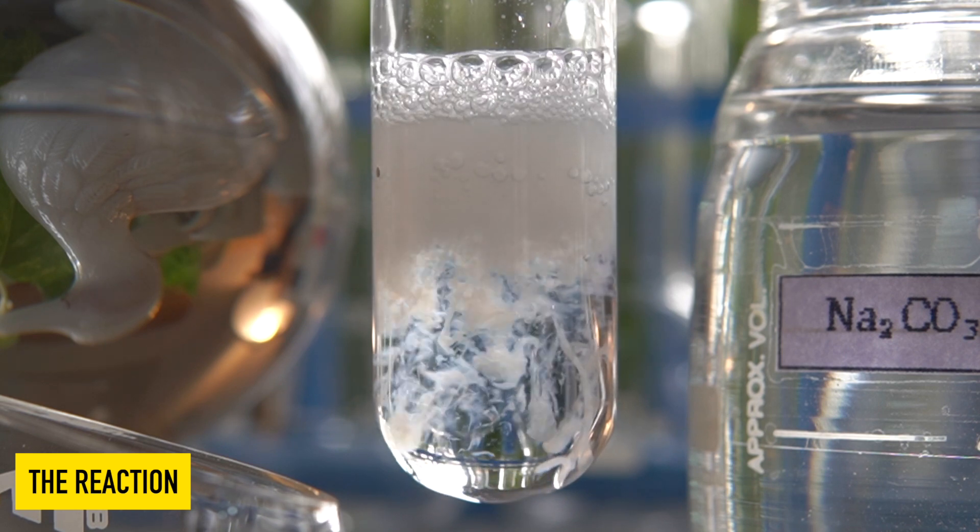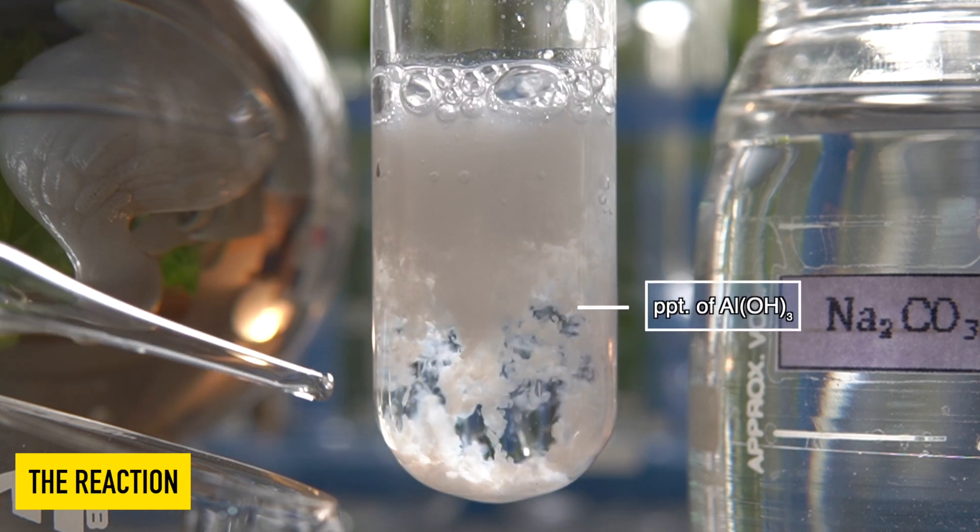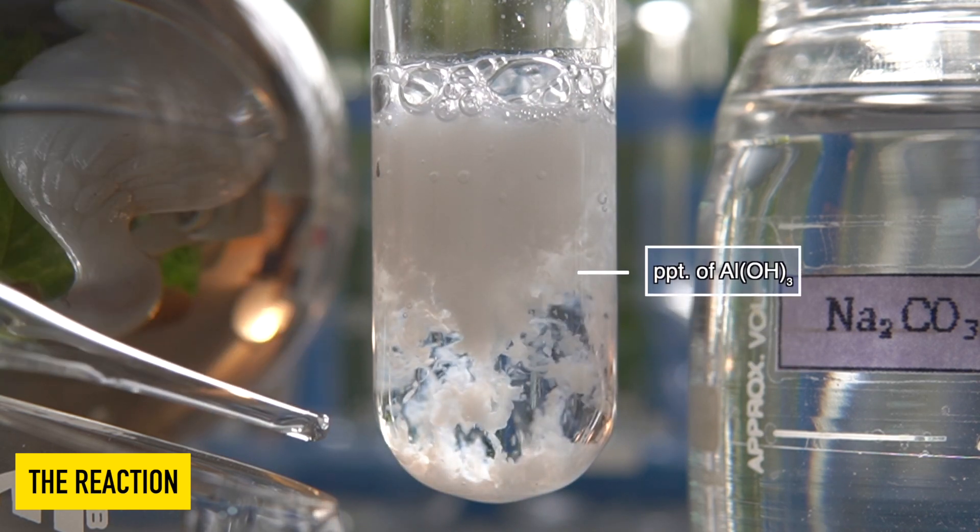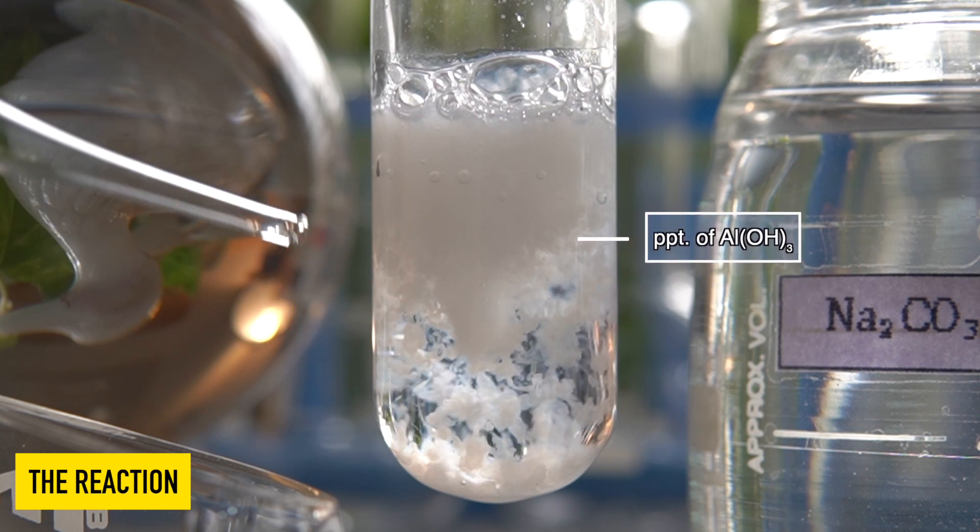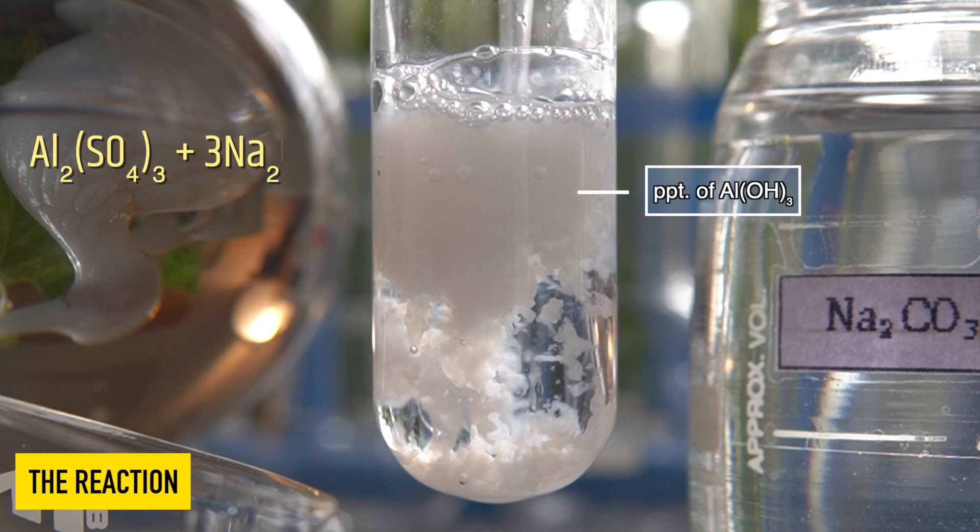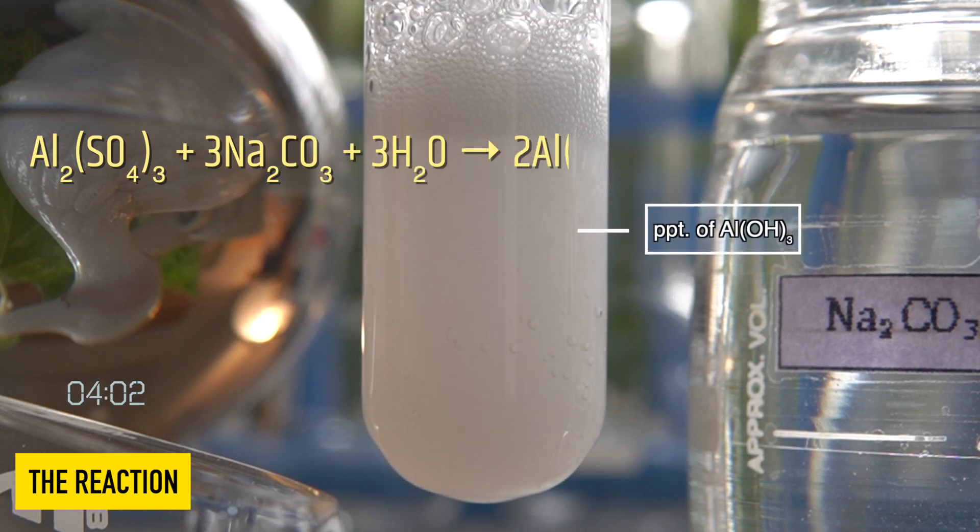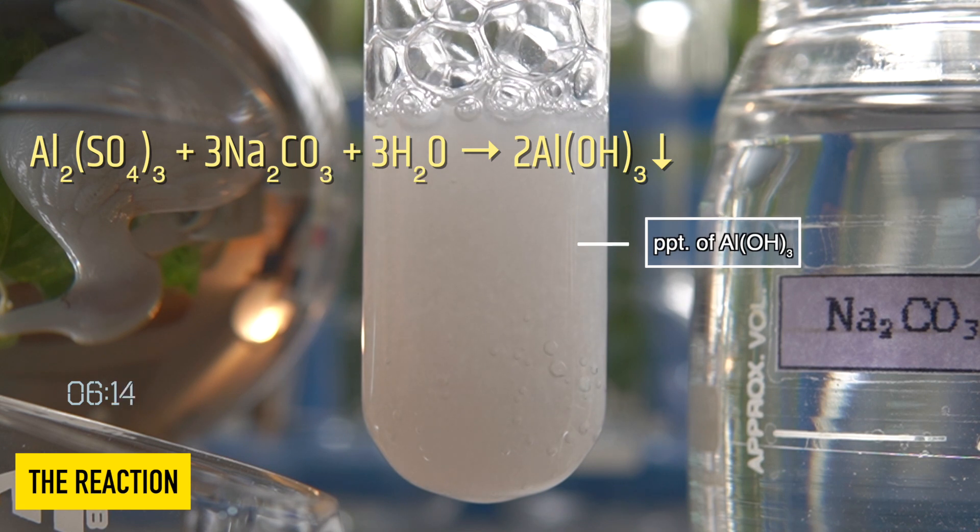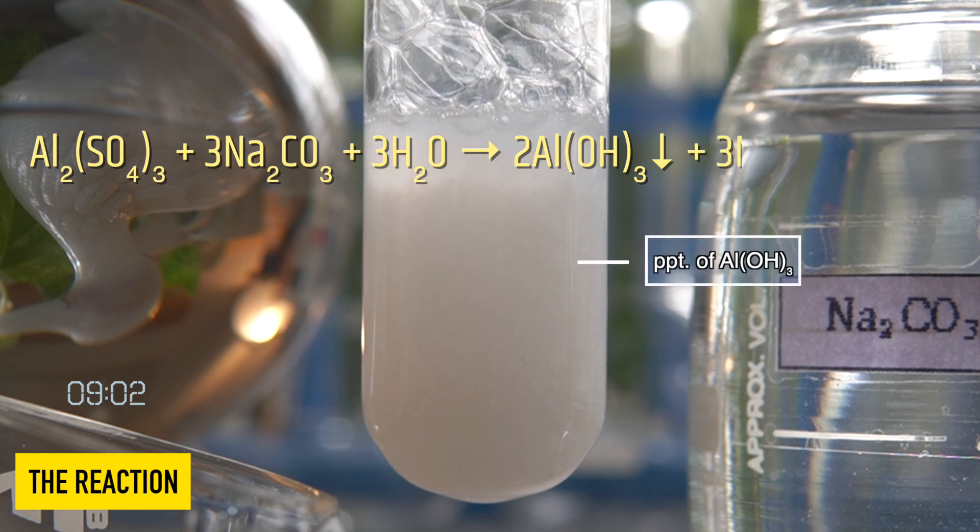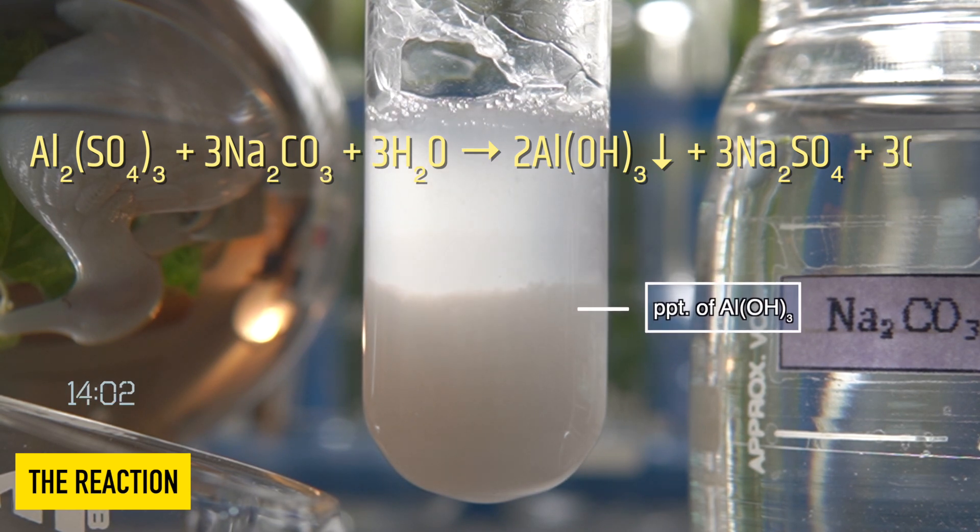The white gelatinous precipitate that has been formed inside the test tube is nothing but aluminum hydroxide. So in this reaction, aluminum sulfate reacts with sodium carbonate to produce a white gelatinous precipitate of aluminum hydroxide along with sodium sulfate and carbon dioxide gas.